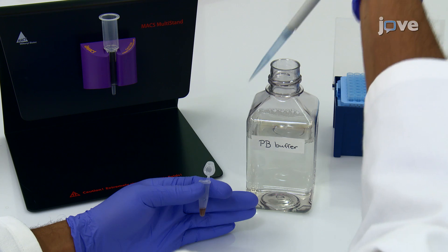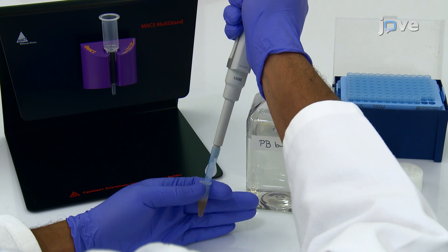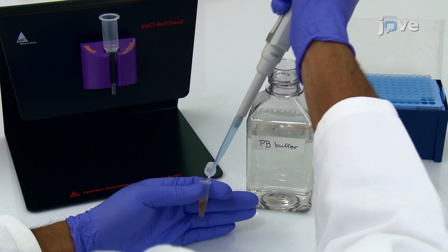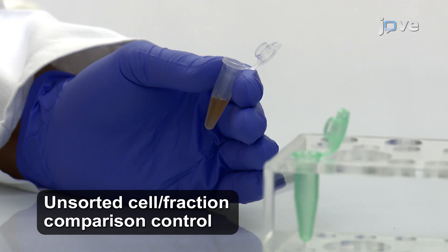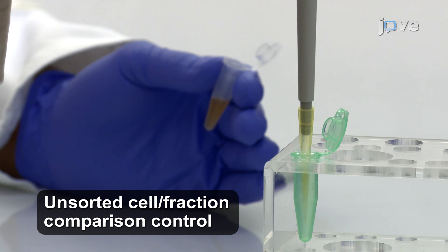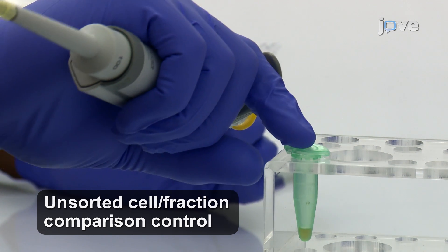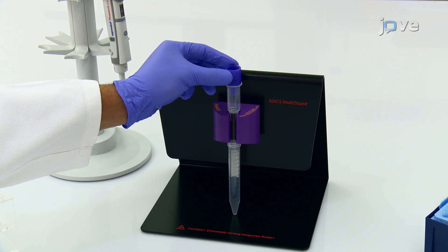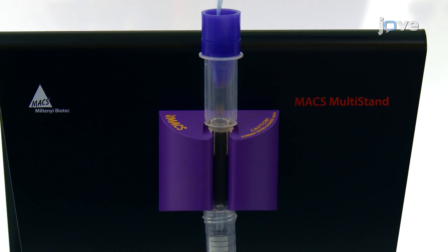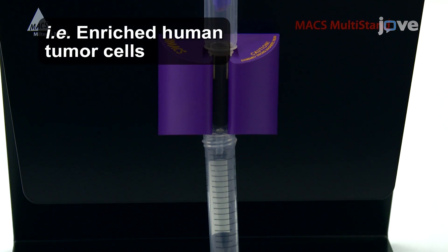At the end of the incubation, add 420 microliters of buffer to bring the total sample volume up to 500 microliters, saving a 50 microliter aliquot at 2 to 8 degrees Celsius for later flow cytometric or molecular analysis. Then add the cells onto the column using an equilibrated 70-micron mesh strainer and collect the unlabeled target cell flow-through.